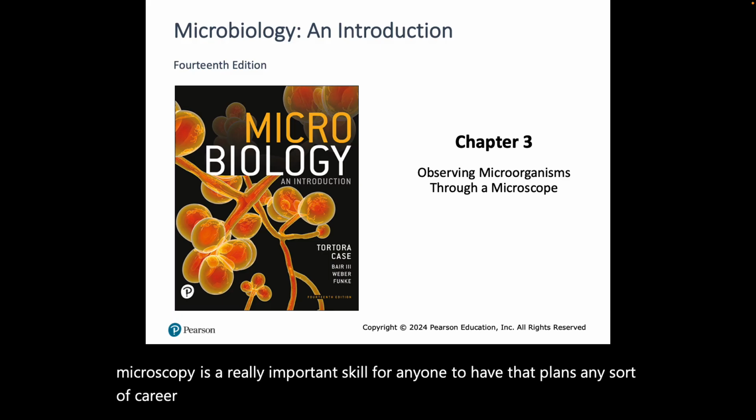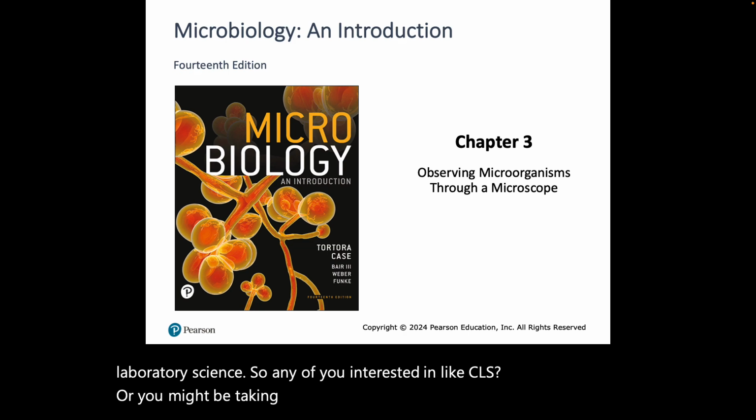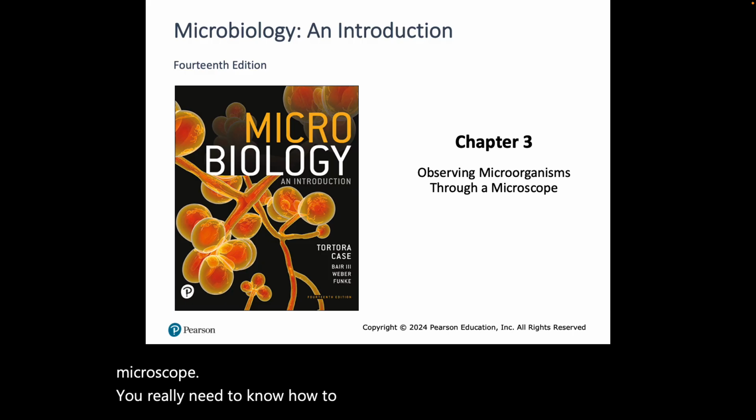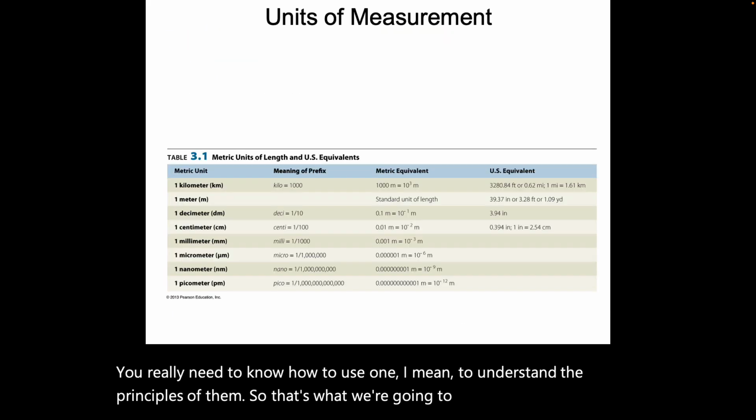that would include things like clinical laboratory science. So any of you interested in CLS, where you might be taking patient samples that you want to look at under a microscope, you really need to know how to use one, and to understand the principles of them. So that's what we're going to cover today.